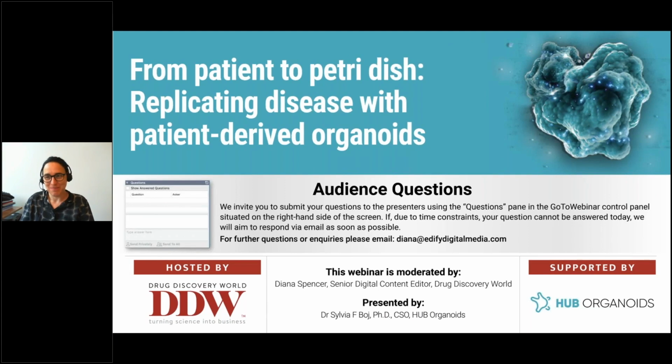Okay, so our first question is about PDCOs from biopsies. Is there any specific protocol or tricks or troubleshooting to increase the efficiencies? I will assume that when they mean PDCOs from biopsies, they are talking about establishing them from cancer or tumor biopsies.